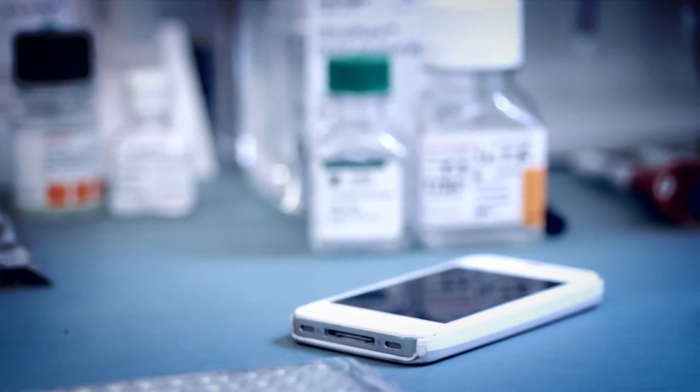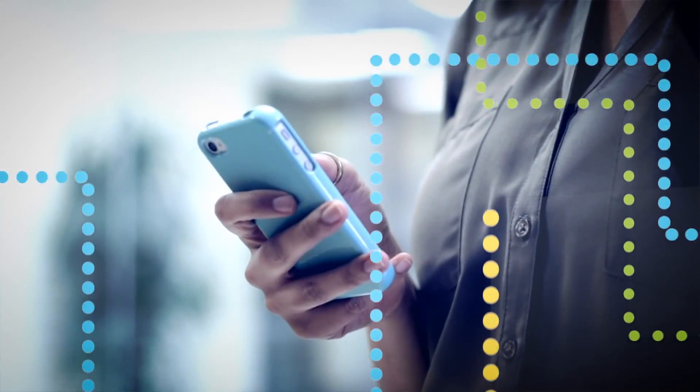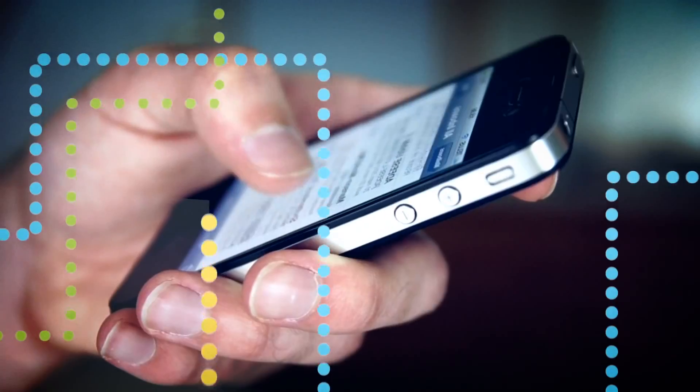And what if all that important work could be done, not just now or in the lab, but on the go and you could actually observe and communicate with it from a handheld device? Just like the way you can check a flight arrival status before you've even left the house simply by checking your phone.